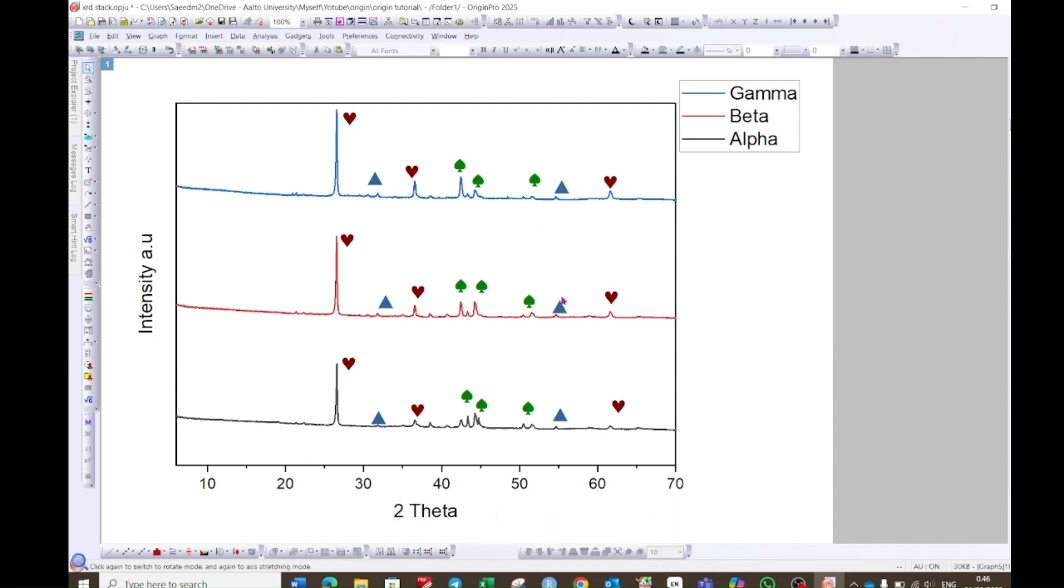When you are done identifying the peaks, then again choose these symbols. Press Ctrl+C and Ctrl+V. The symbols will be copied. Now drag these symbols to the side of the graph. Now choose this text box again. Place it right next to the symbol, and here you can write the name of the symbol. For example, here if I want to make it as a subscript to number 2, and then here you will see the subscript option. Click on it and it will be done.